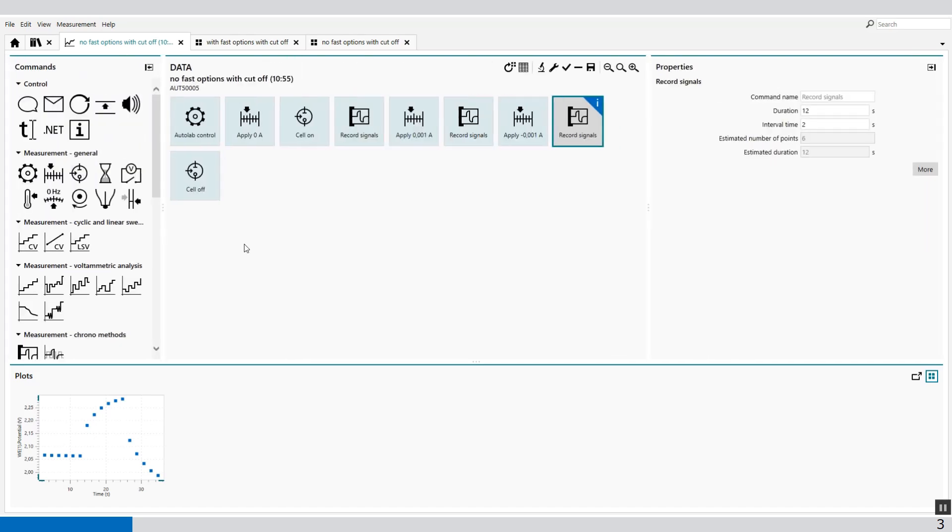But if you want to measure this at a faster rate, then we can use the fast options. The record signals command provides access to additional measurement options through the button additional measurement command properties.